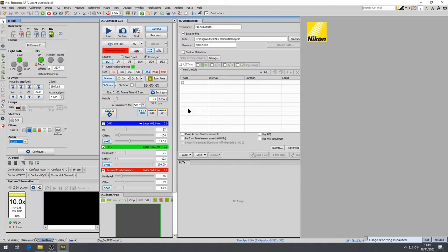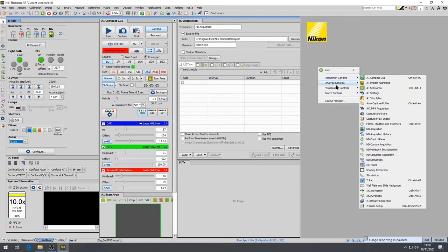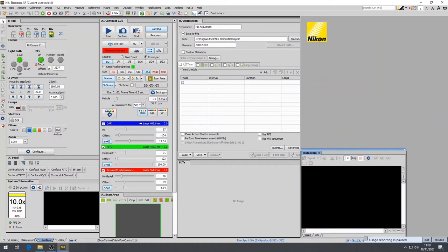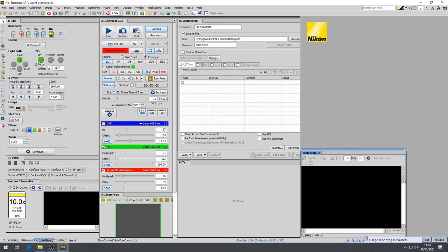But also important is the histogram. Both the histogram and lookup tables are important. These give you numerical information regarding the distribution of pixel intensities across your live and acquired images. And you can also adjust the brightness and contrast of your image to highlight specific features. And that can be done either manually or automatically.